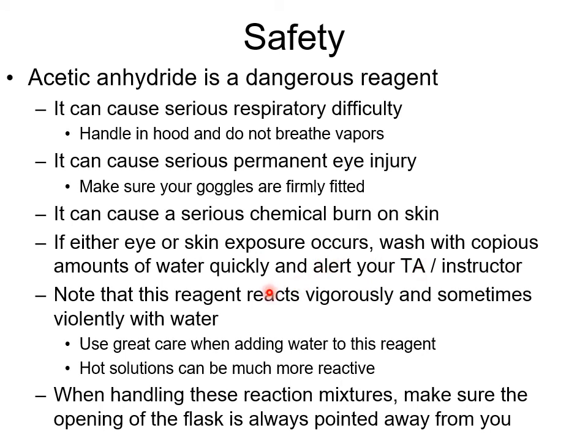Remember that this reagent reacts vigorously and sometimes even violently with water, so be very careful when using it. And when it's hot, it's a lot more reactive, right? So be careful with that as well. So when handling these reactions, make sure the opening of the flask is always pointed away from you. You don't want to be looking into your flask. That's very dangerous to do.